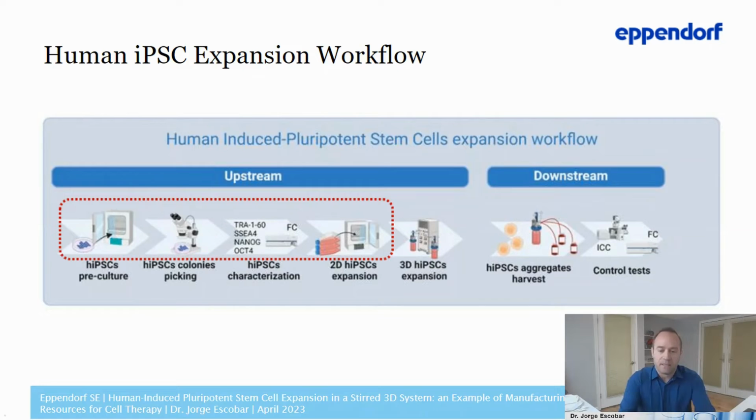So let me explain in detail the iPSC expansion workflow used in this work, as you see in this slide. The first steps were the iPSC preculture, the colony picking process to avoid impurities, followed by iPSC characterization and then the expansion. So let me explain the process step by step.